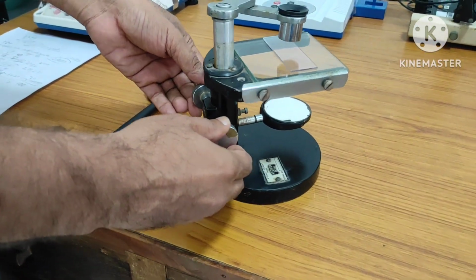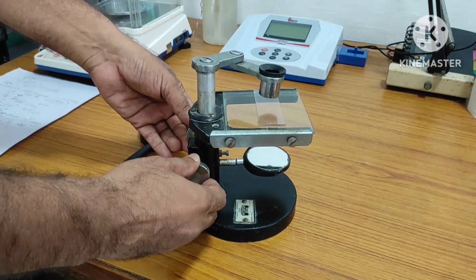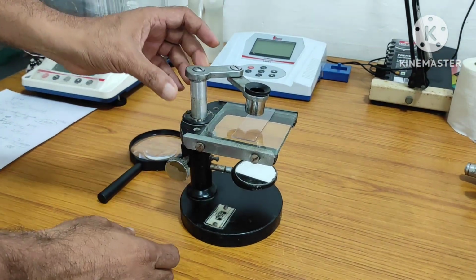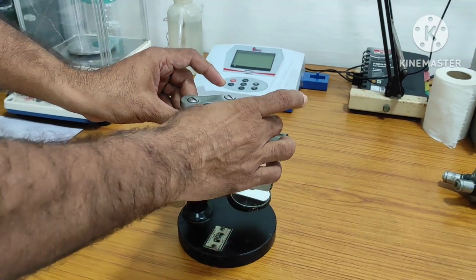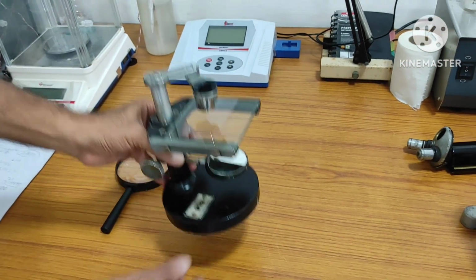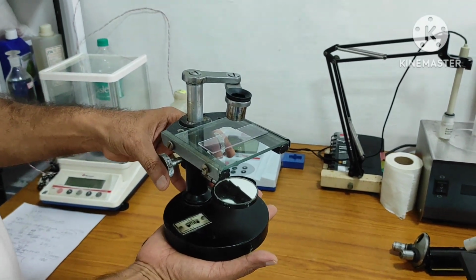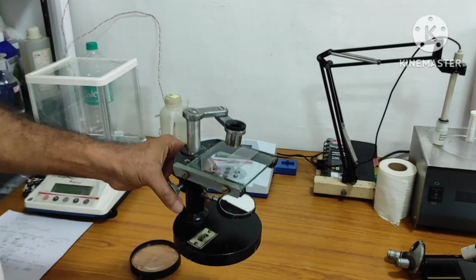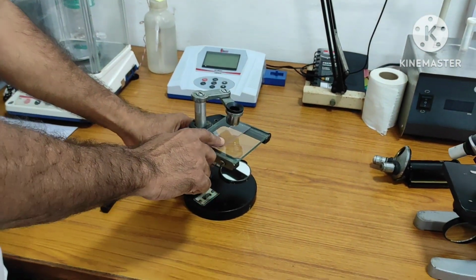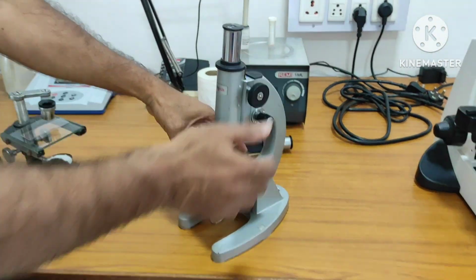Only one type of knob is present in simple microscopes, that is the coarse knob only. There is no fine knob here. This is the stand, and with the stand the arm contains one eyepiece. So this is called a simple microscope, where only one lens is used to observe small specimens.